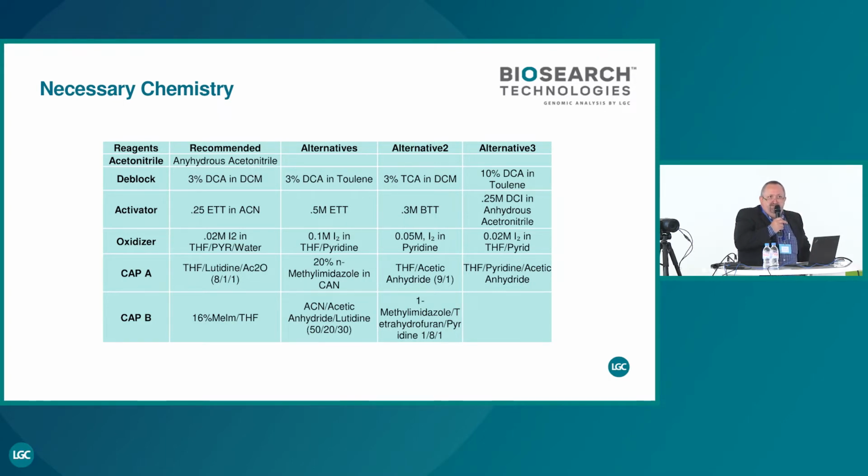Because this is something very common for oligonucleotides. You produce a small quantity of oligo. Let's say if you start at 1 micromole scale, at the end you will have 1 milligram. And when you see all these liquids you are using, all are waste. You start with it, at the end it's a waste.